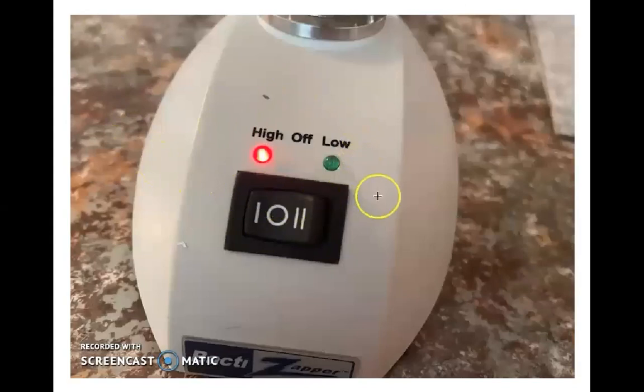Note too that a lot of incinerators have two settings. They've got a low heat setting and a high heat setting. Now, I happen to be using the high heat setting today, but depending on the incinerator, the low heat setting might be just fine. Incinerators can get very hot, and sometimes having the incinerator on the desktop on high is just unbearable because it's radiating so much heat that it's making you hot sitting 2 and 3 feet away from it. So the reason the low setting is there is because some incinerators will get plenty hot on the low setting.